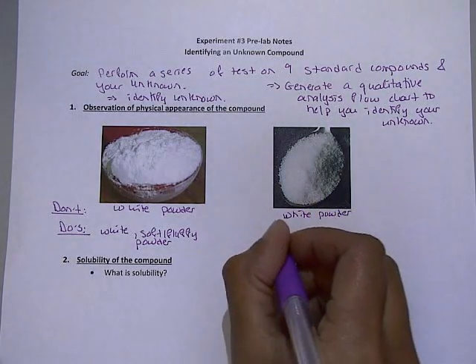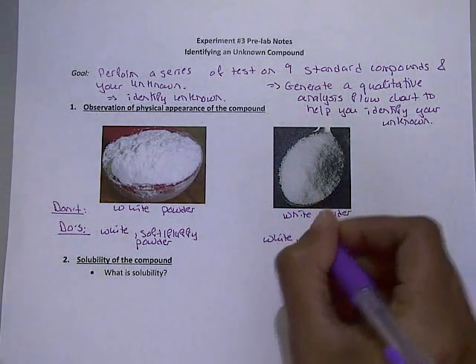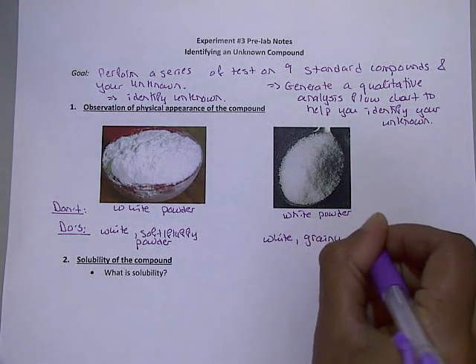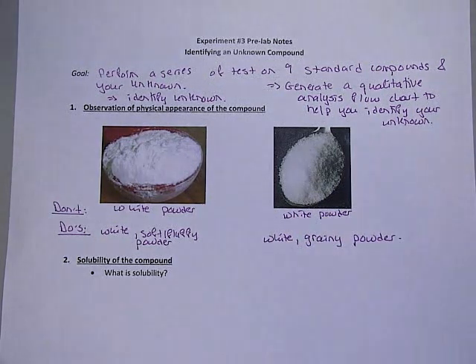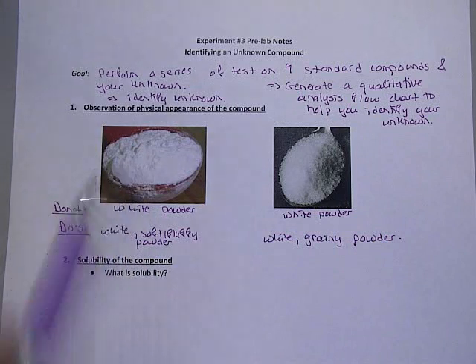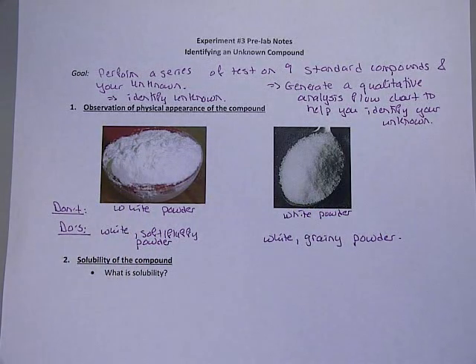Now this powder, on the other hand, is also white, so let's write down the color. But it's not just white, it's actually grainy. So a good observation of the physical appearance of these 2 compounds: this one's a white, soft, fluffy powder. This one's a white, grainy powder. That's the objective of part 1 of this experiment: to make observations of your standard compounds and unknowns.